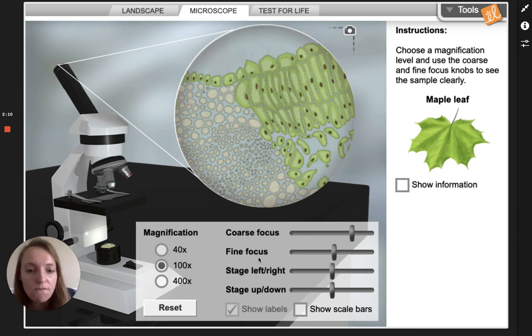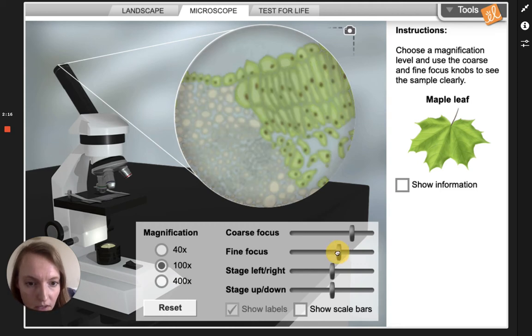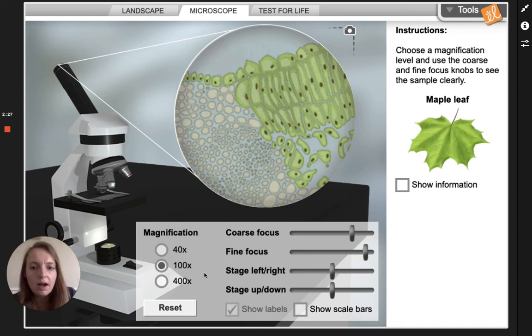We don't want to virtually — or in real life — smash the slide. So you're gonna use the fine focus, that's the second option, to focus the slide. I'm gonna try to focus it a little bit more. Okay, there you go — I used the 100x and it is focused.